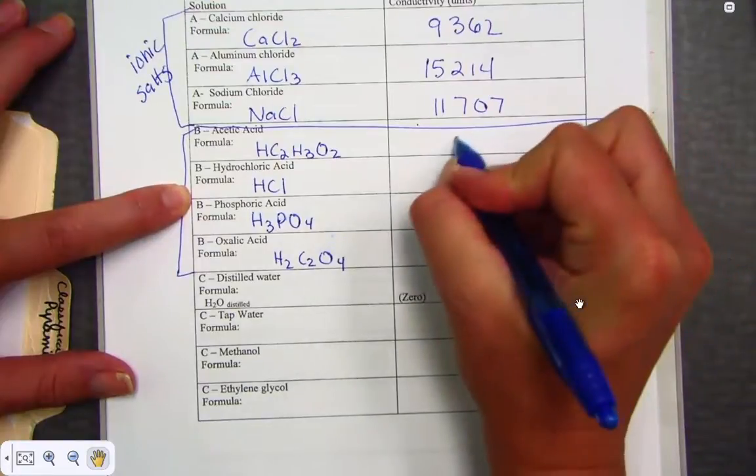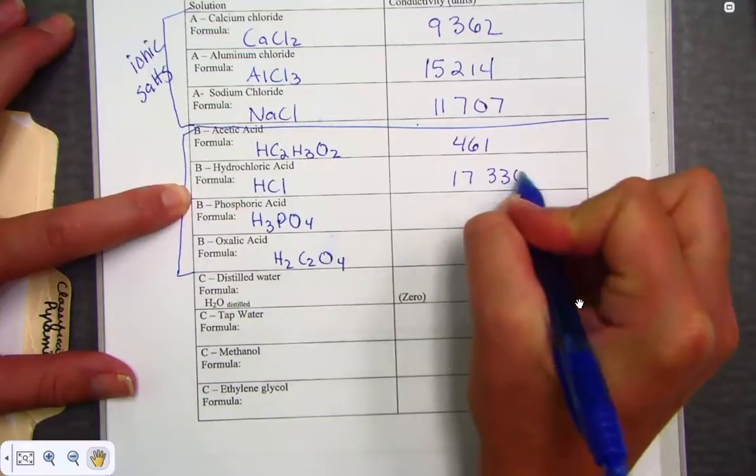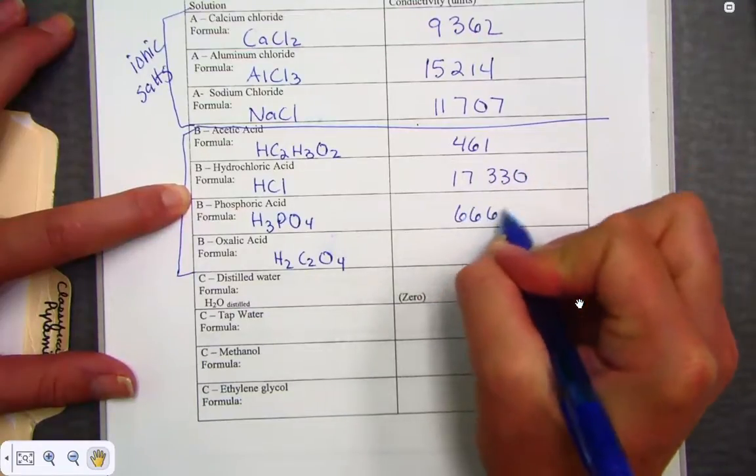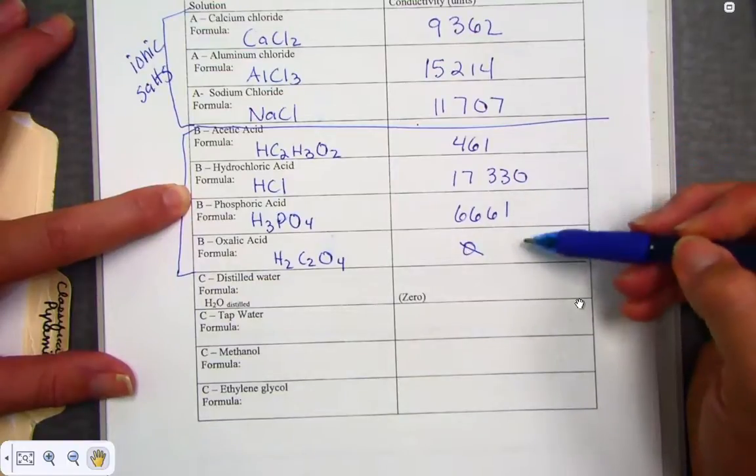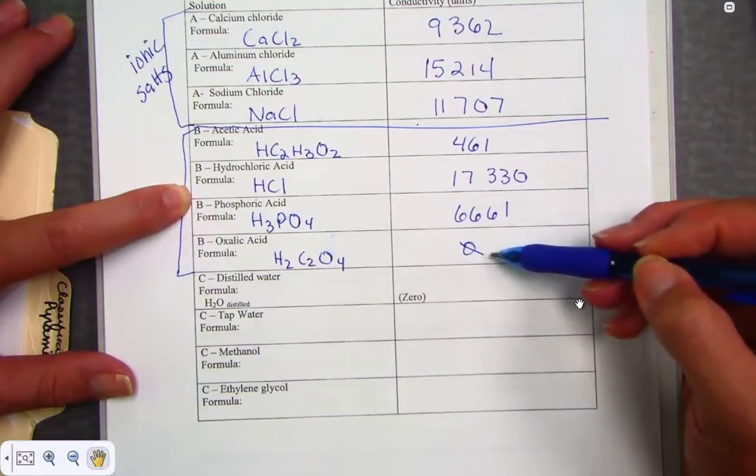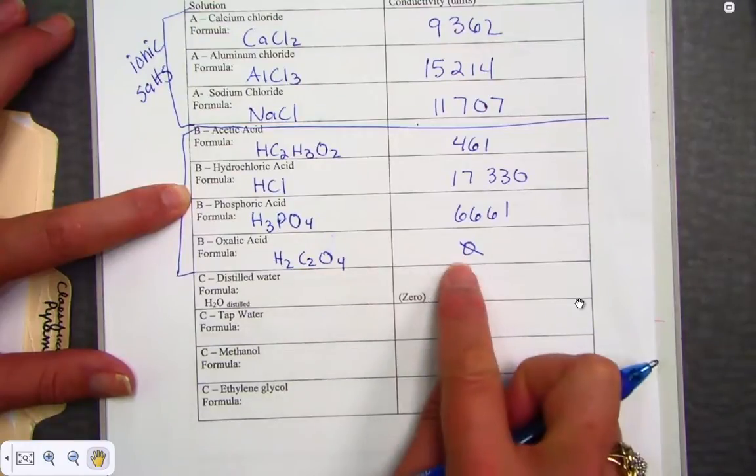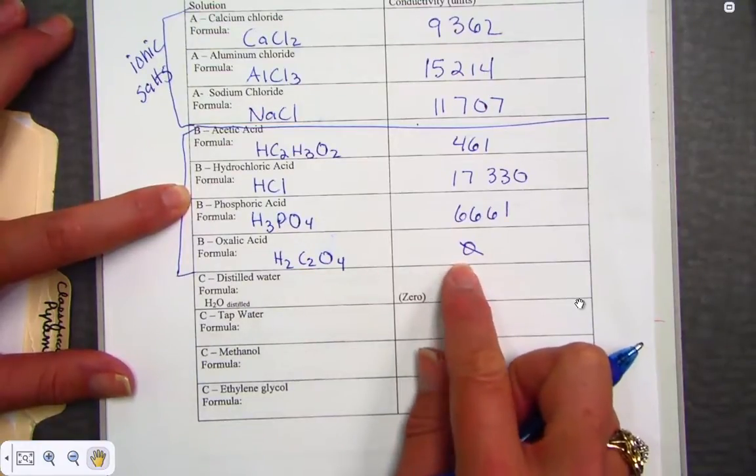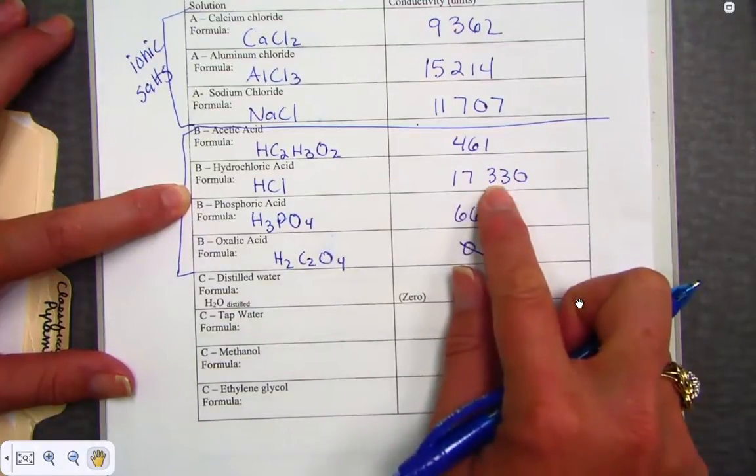I'll give some values for you to just compare the magnitude when I conducted. This is the values that I found, and you probably had some sort of reading for oxalic acid. This would be suspect, but it was significantly slow. Oxalic acid is very weak, hardly ionizes at all, giving us a very low number for conductivity. HCl is very strong, giving us a very high value of conductivity.